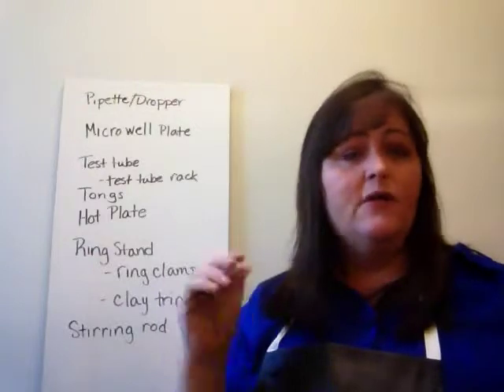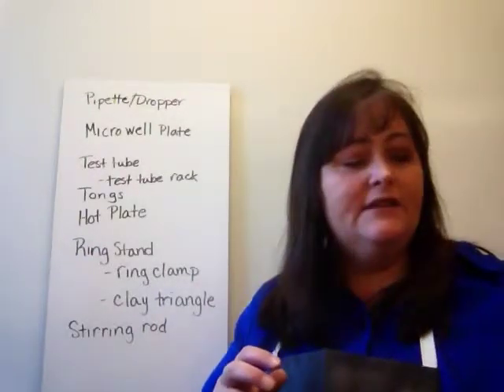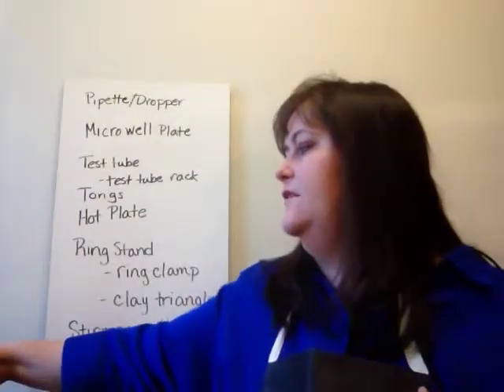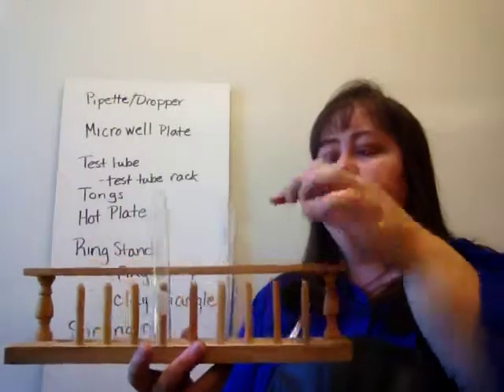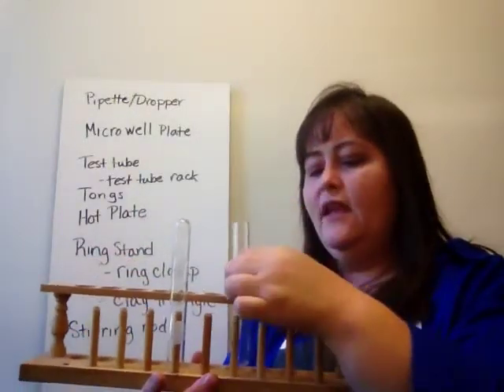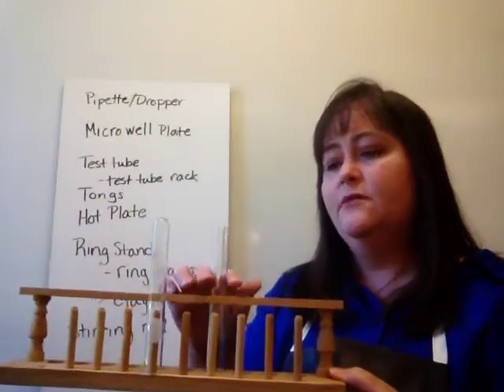So that's what we use the micro well and the pipette for. The next piece of equipment is the one that made me think of science when I was your age. When I thought of science, I thought test tubes. This is a test tube, pretty simple. And this is the test tube rack. It has places to put test tubes while you're putting chemicals in.